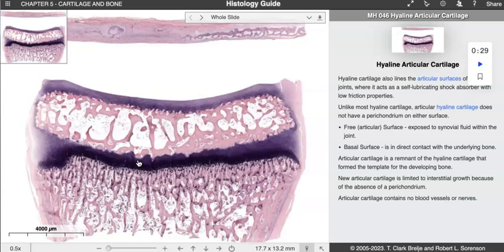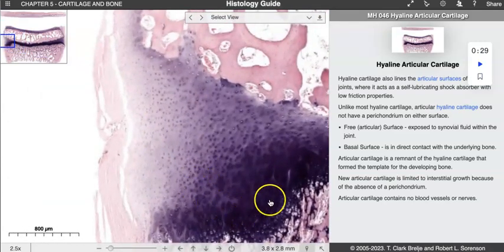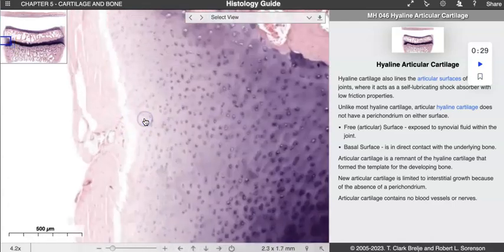active growth plate stops. So let's ignore maybe this area. I can even maybe go on to the side and show you that transition. So you get to see all of the growth zones here for our endochondral bone that we would take a look at in another video. But again, you see really active formation of hyaline cartilage here, and then we're getting more of a transition over here with growth and development in a bone.